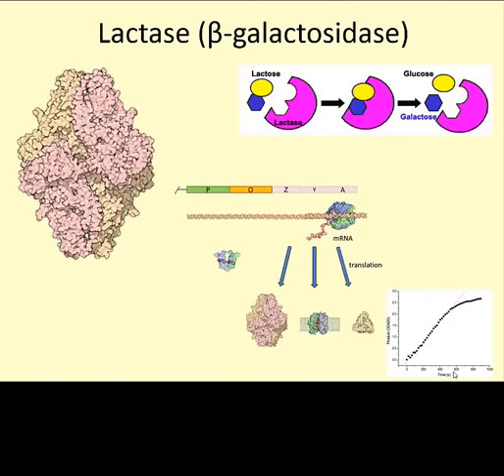In the following lecture, I will present some background on the lac operon, enzyme activity assays, and measuring cell densities in liquid cell cultures. You will learn to measure the activity of the enzyme by measuring the rate at which product appears and the time required for the enzyme to be synthesized. You should have some background on this from LS3. However, the following lecture will go over the basic concepts of the lac operon and laboratory techniques used in the enzyme activity assays to refresh your memory and to prepare you for the actual lab.